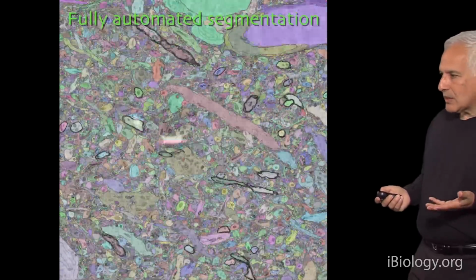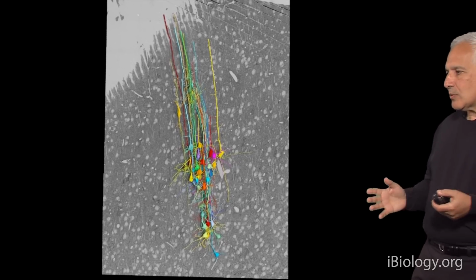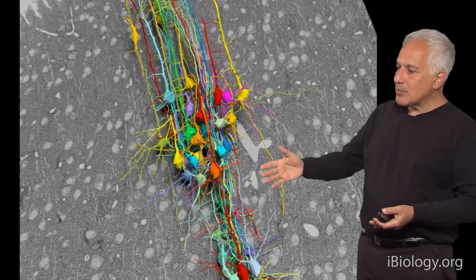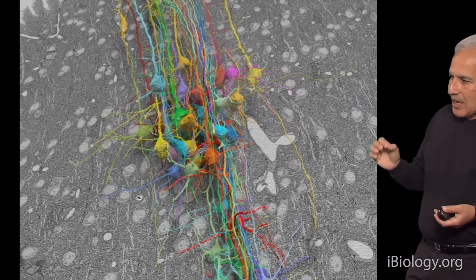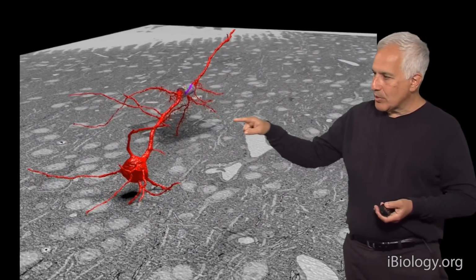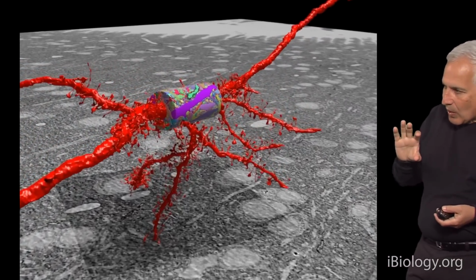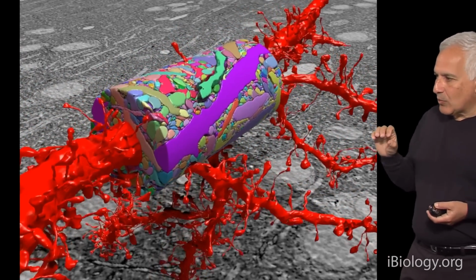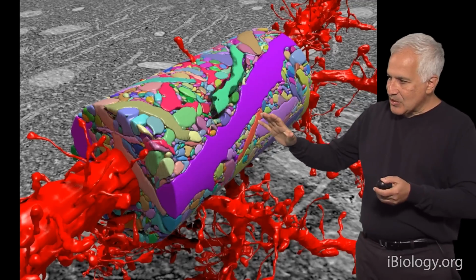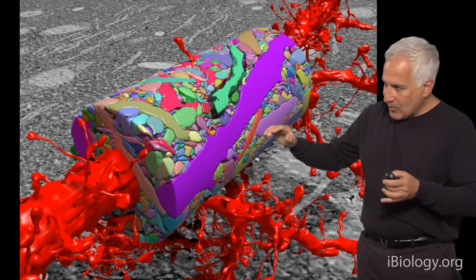So what do we do with data like this? I'm just going to end with a couple of movies to give you a sense of what we're doing. So we sparsely reconstruct a bunch of neurons in a cortical column in the cerebral cortex. And then we decided for one of those neurons, we would learn everything we possibly could about 1,000 cubic microns around one apical dendrite of one pyramidal cell. So this little cylinder is everything inside one little region of the dendrite of one cell, just around it.